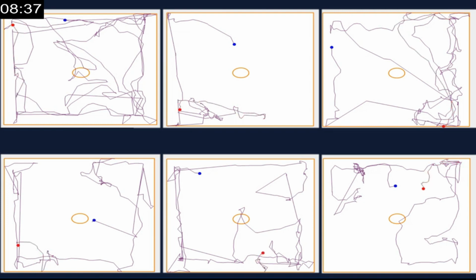The floor of this box should be wooden material so that we can easily clean it after each animal test, so you have to maintain that. In the middle of the box we should put a little bit of tasty food for the animals to find during the experiment.